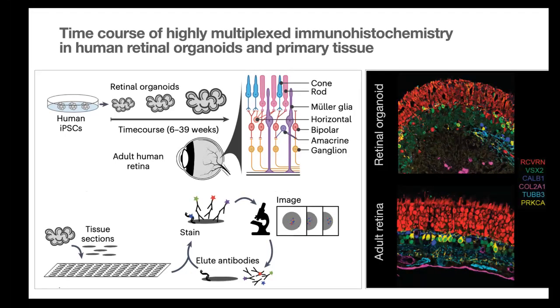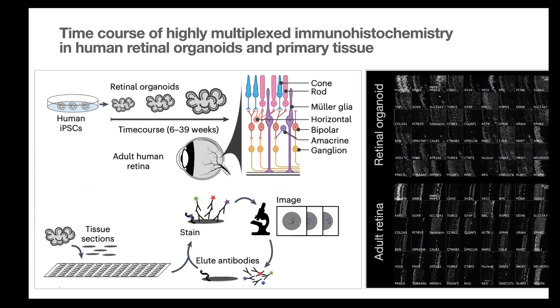So in total, in this data set, we had 45 stains and up to 30 or so organoid slices. So rather big data set actually. And now just an overview here, it's a lot of data. You cannot really grasp all the images and make sense of them by just creating overlays. It's overwhelming, too many permutations in there.